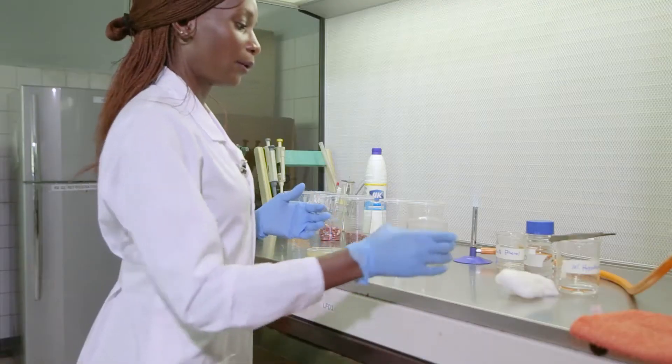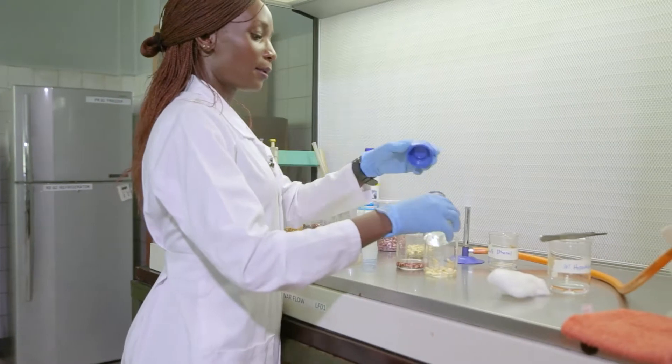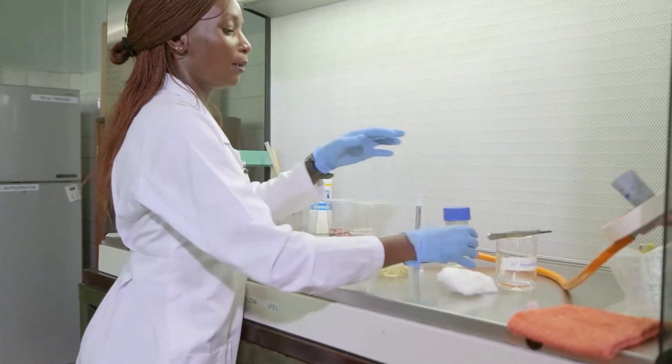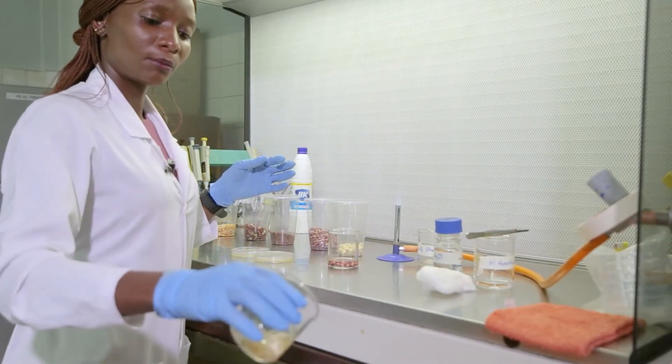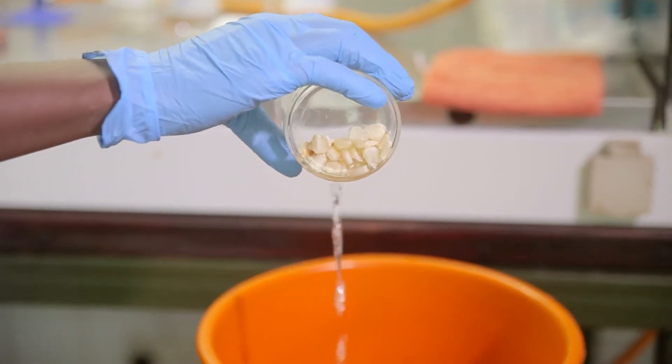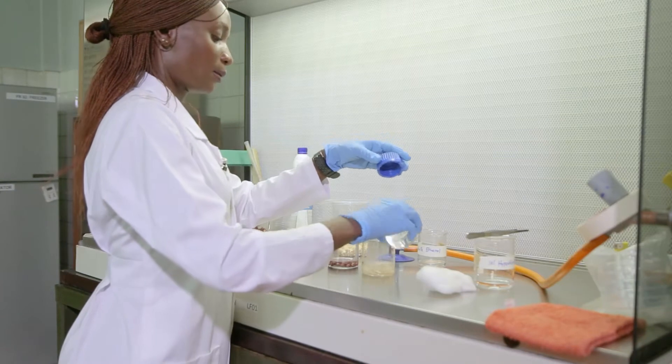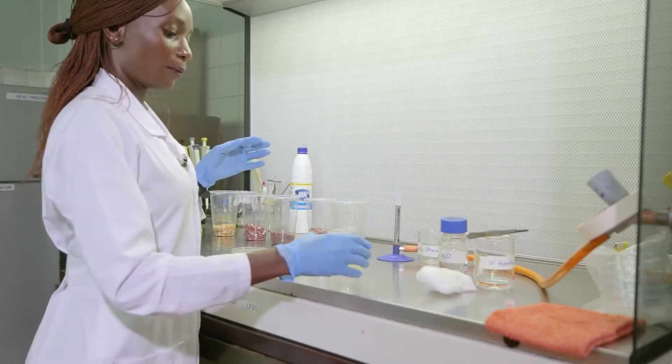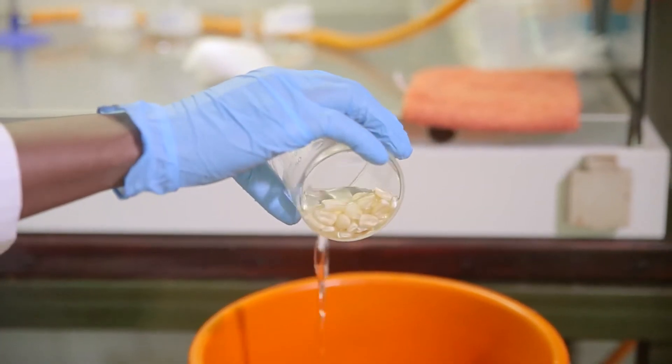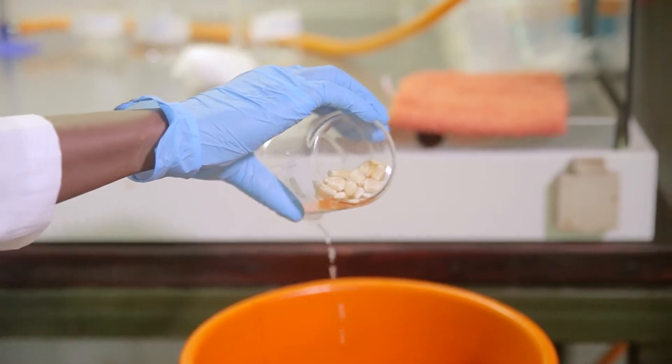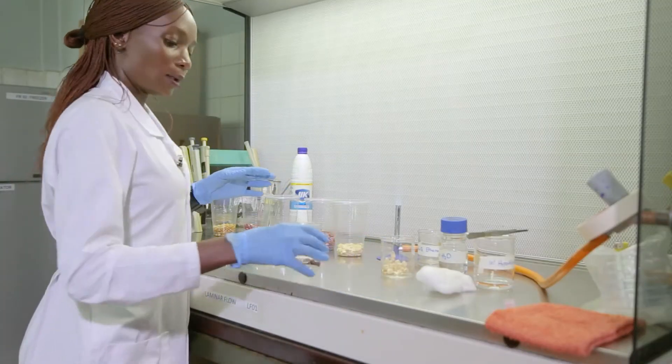So I pour off the hypochlorite and I'm going to rinse off the hypochlorite with my sterile water. You rinse twice to remove any traces of the hypochlorite. So that is done.